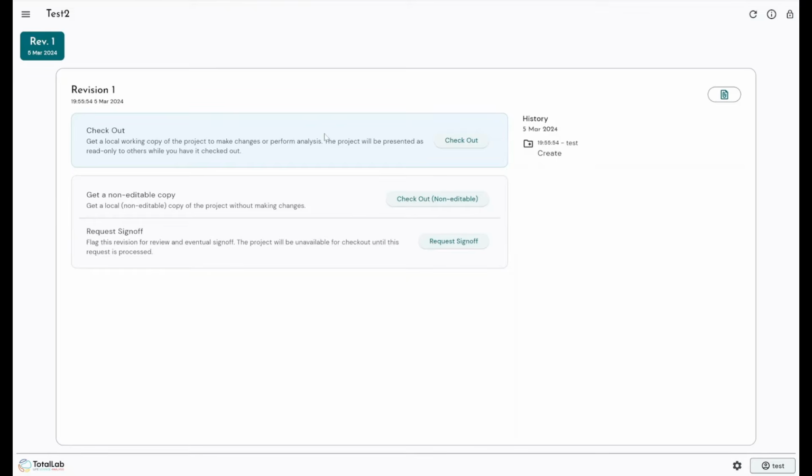When you click check out a copy of that data, so never the original data, always stays in the secure folder in an immutable copy, again to comply with 21 CFR and GMP regulations. When you click check out, you take a temporary copy that is then worked on, and then you check it back in after you've performed your work, and it's added as a second revision next to the first revision within the secure folder. So the original always exists. No files are ever deleted within our 21 CFR solution within AuditSafe, but we always work on copies and check them in when we're happy with the work that we've finished.